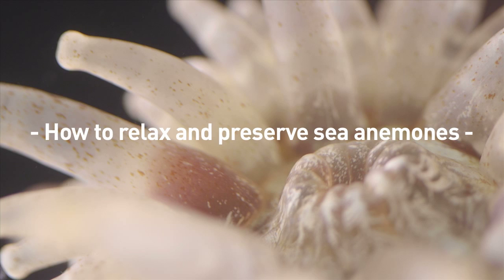In this video, I'm going to walk you through on how to relax and preserve sea anemones.